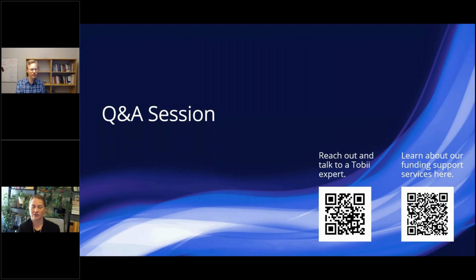Now, Marcus, I know that you mentioned you used the Spectrum for the data collection of this. Remind me, were you running that at 1200 hertz? It's 600 hertz. Okay. To this point, do you have a recommendation for the speed, a sort of a minimum speed that you would say would be the best for calculating eye openness to then count blinks the most accurately?